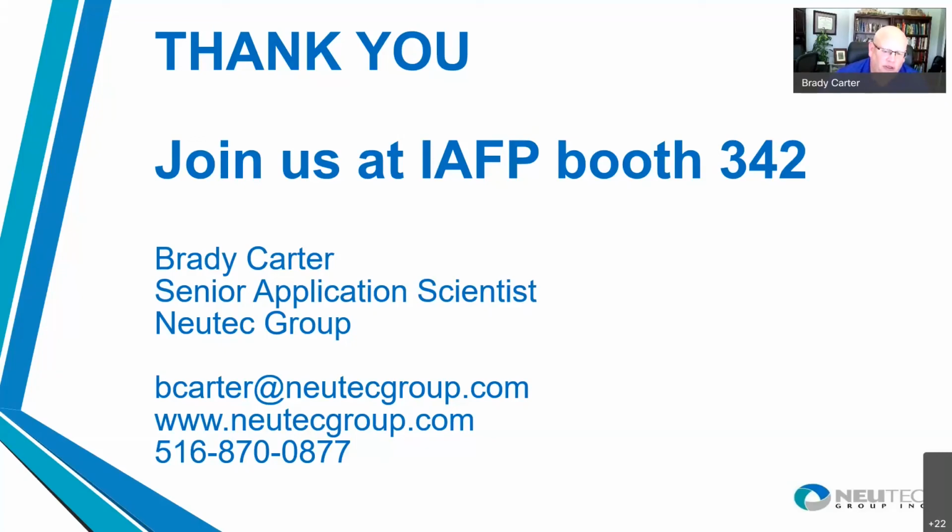So that's important just from a production standpoint of what can impact the final water activity of the product. But it's also important that the sample that's going to be used for testing not be left exposed to the environment either. If you bring a sample in and you have it open to the room and you set it on the countertop and then wait 20 minutes before you read water activity, the water activity of that is not correct, because during that whole time it's changing based on whatever the relative humidity of the room is.